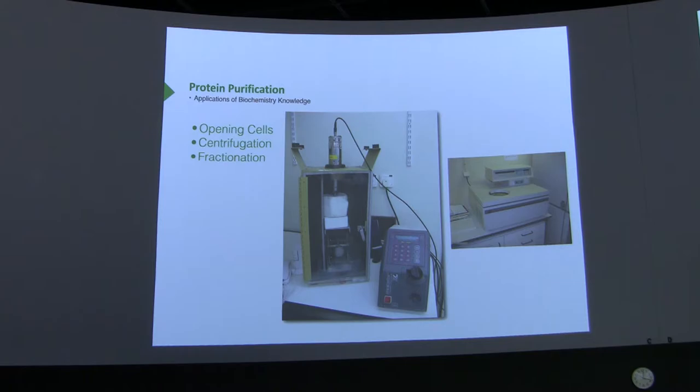The key to isolating anything is fractionation. Fractionation means that you are isolating using a treatment to separate things into usually one versus the other. For example, a fractionation that might happen with centrifugation would be I would take my busted open solution and spin it at, let's say, relatively low centrifugal force. Under low centrifugal force, the very biggest things will precipitate. They'll come to the bottom of the tube. This may include, like I said, membranes and things like that. The smaller things, the biomolecules, the soluble proteins and so forth, will not precipitate at the bottom. So if I pour that off, I've got one tube that's got liquid that's got what didn't precipitate, and I've got another tube that has stuff stuck to the bottom that did precipitate. So I've just fractionated. I've separated them. Fractionation simply means separating on some basis.